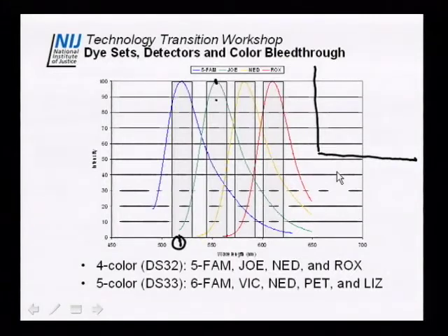going back to this plot, and we'll use the example where you have a number of green dyes coming through, and on the detector side you'll have 4 detectors in this case, detector number 1, 2, 3, and 4. Detector number 2 will say, when this green dye comes through, I'm going to see 1,000 counts on my detector. So we'll just put 1,000 here.